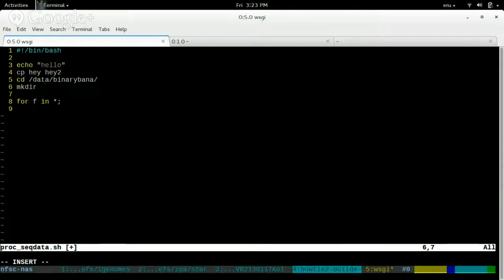And so let's make a directory in my home directory called results here. Then for every file that I'm going to process, since they're all empty files at this point, I'm just going to say echo processed file f, and then I'd like to be able to see the results from that. So I'm going to output the results into my home directory, results, f.results. And then I think I say done. Do I need a semicolon? I forget how to write for loops on multiple lines in Bash. Oh, I need a do. That's what I need. Okay. I don't think I need that one. Or that one.